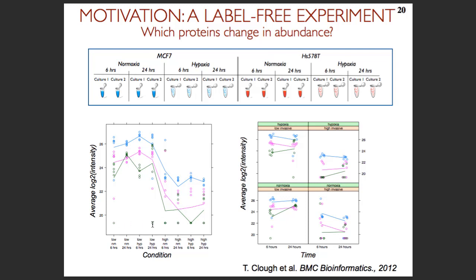And here are the low dots. These are the missing values, which were just denoted with some low values. So some peptides are not entirely consistent. There's some variability here. And the goal of our work is to integrate all the information which pertains to this protein in this particular experiment and ask a variety of questions which may be of different complexity. This is another view of the same protein. So now you can look at the hypoxia versus normoxia for different exposure and different cell line.